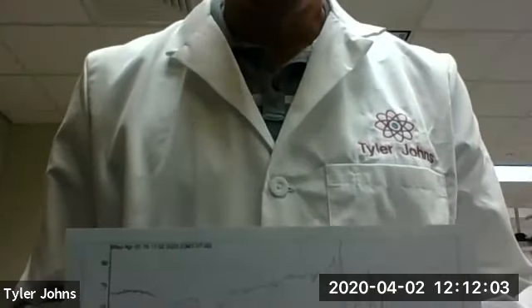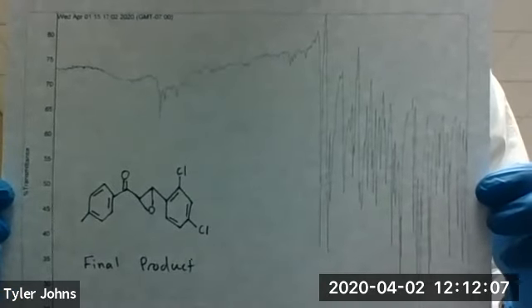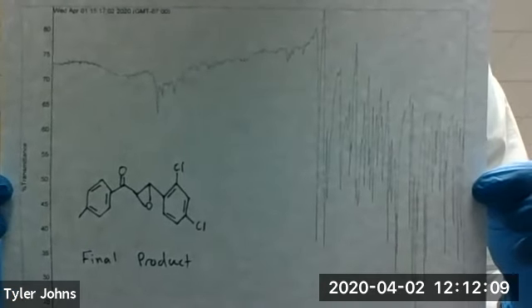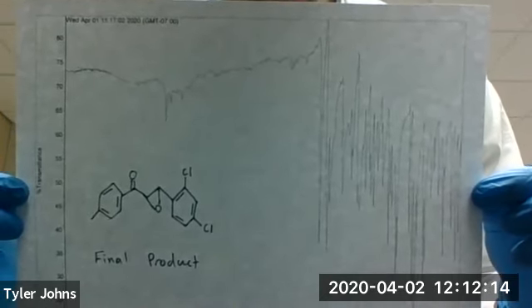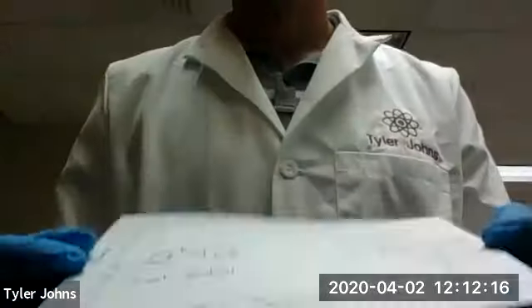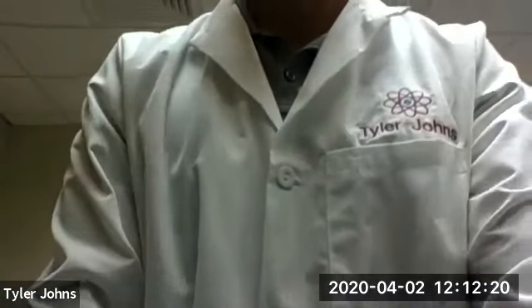This is an IR of our final product — our final epoxide. And that concludes our epoxidation of chalcones experiment.